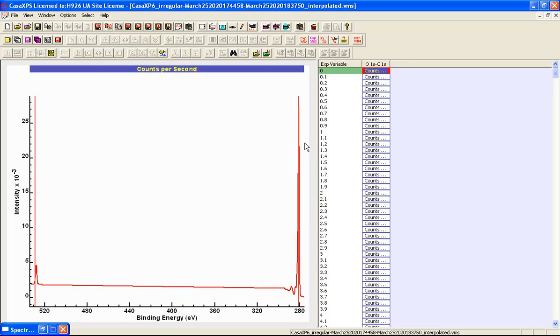the problem now is to scan through these data until we end up with something that looks close to polystyrene and another one that looks close to the PVP.